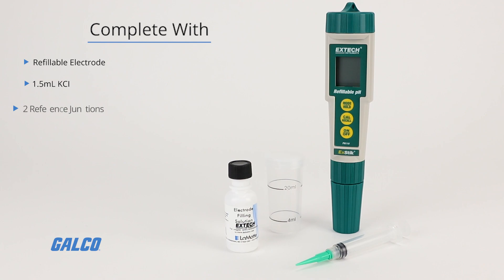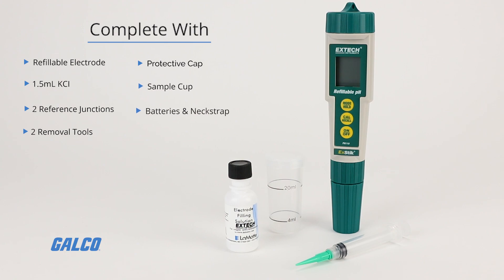Also included are two reference junctions, two removal tools, a protective cap, a sample cup, batteries, and a neck strap.